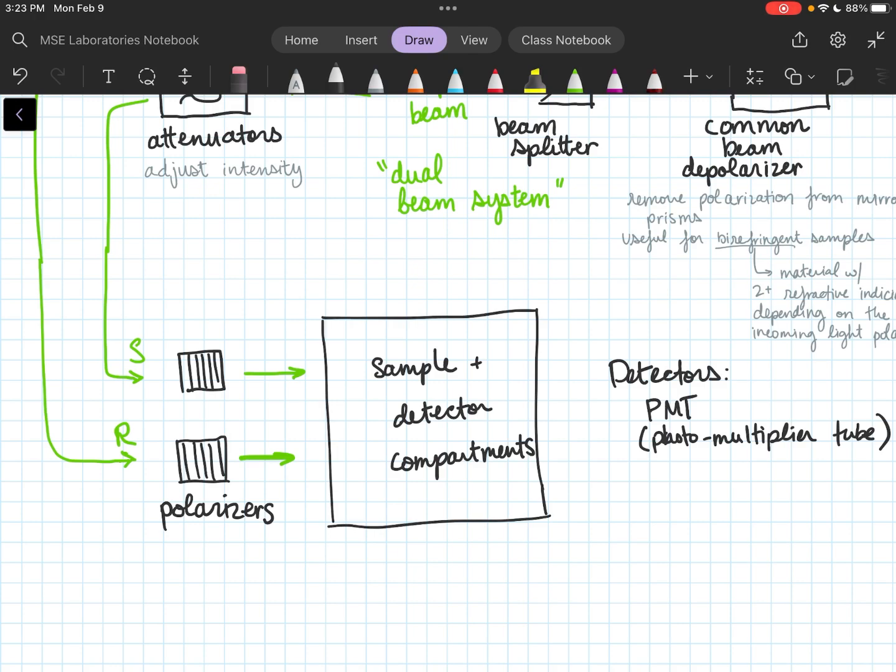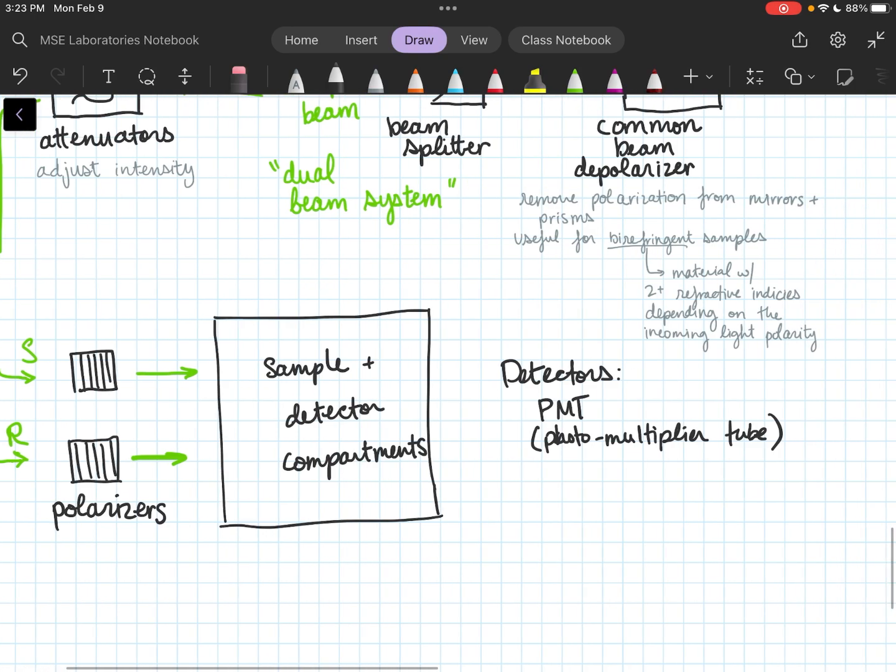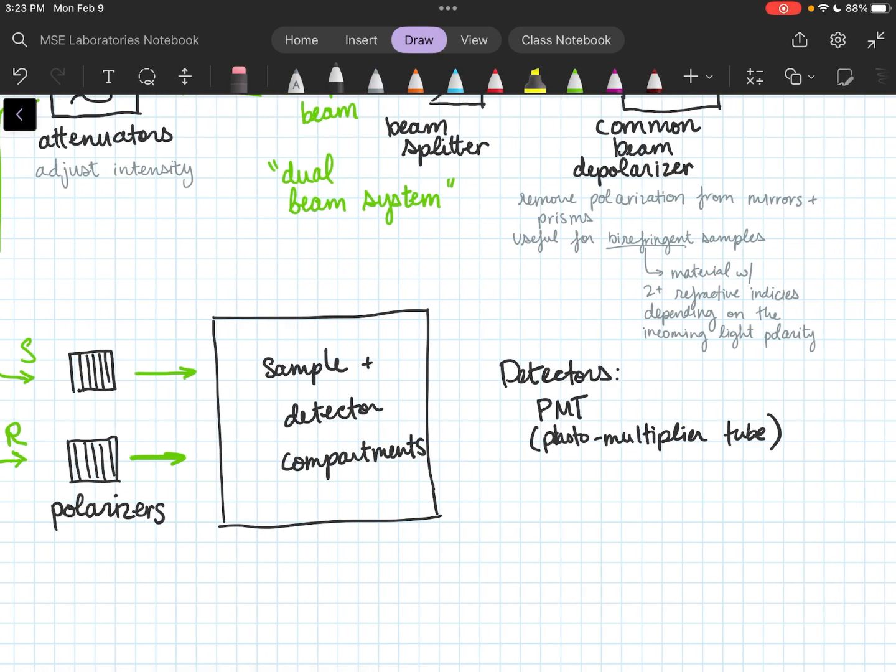It takes some sort of light, whether that's X-rays or visible light or UV or whatever, and it just makes the signal bigger by bouncing it back and forth against a material. Big enough to the point where it hits a detector and the detector's like, hey, I got a signal, where one wavelength wouldn't have been big enough to prompt the detector to find anything. So photomultiplier tube: photo, like visible light, multiplier makes it bigger. So PMTs are found everywhere. There's lots of information about those.